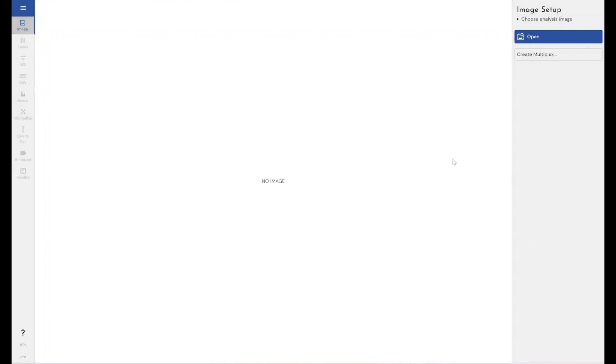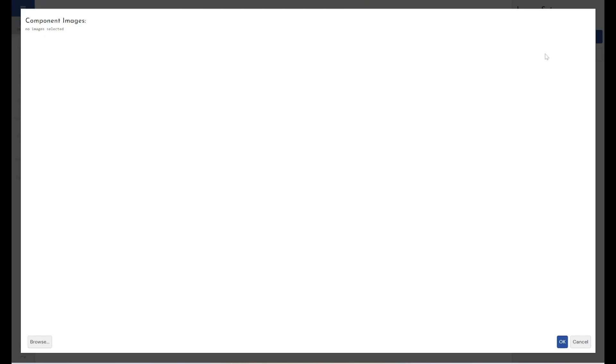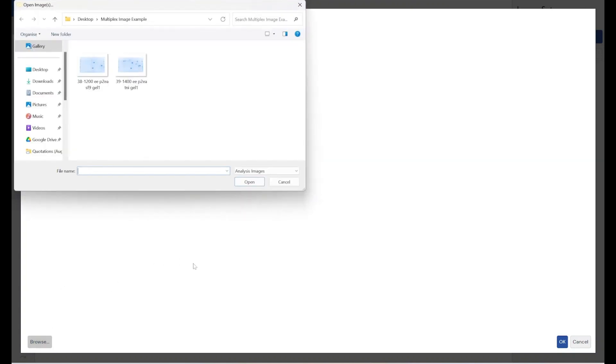To create multiplex images within Phoretix 1D, we open up Phoretix 1D and before inserting an image we get these options. You've got the option to open an image and the option to create a multiplex image. So we want to go ahead and click create multiplex and we'll be presented with this window here. Now you can drag images in from Windows or Mac file explorer or you can use the browse tool here.